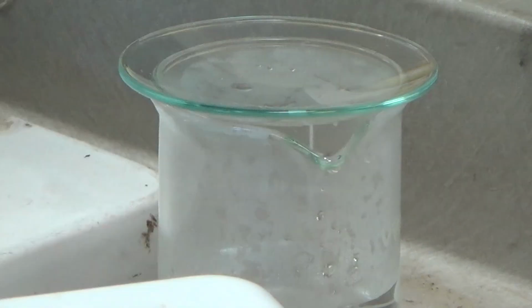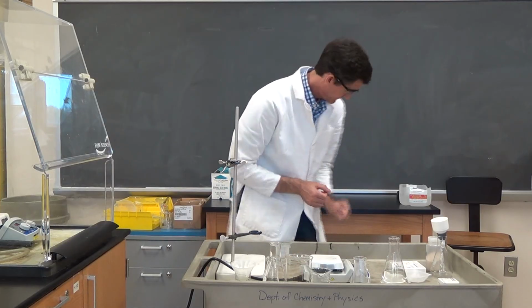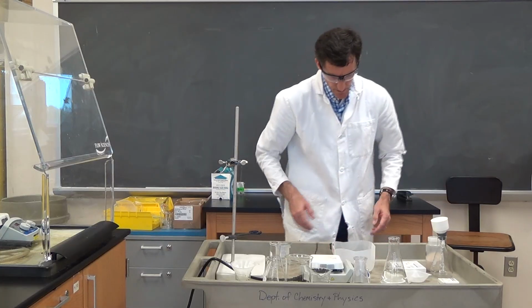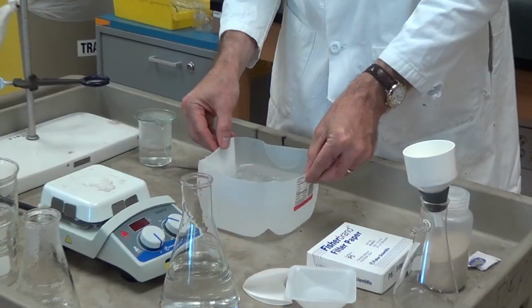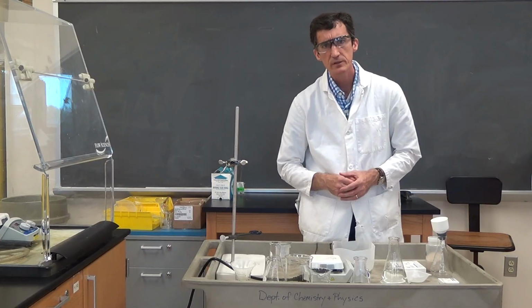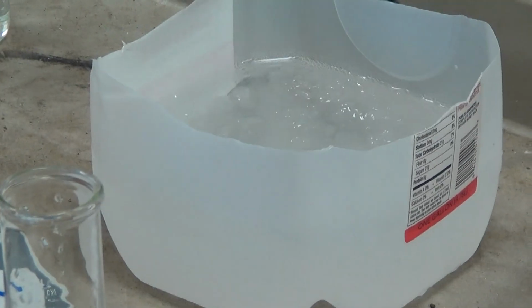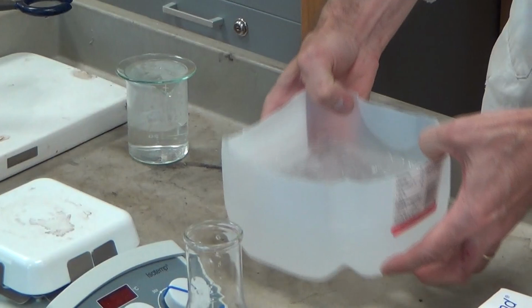Now once this cools a little bit, we're going to put this into an ice bath. An ice bath here. Bath is important. This is both ice and water. Just ice is not going to be as cold as ice and water. Stick your finger in it. What you can actually do is get this sort of thick.